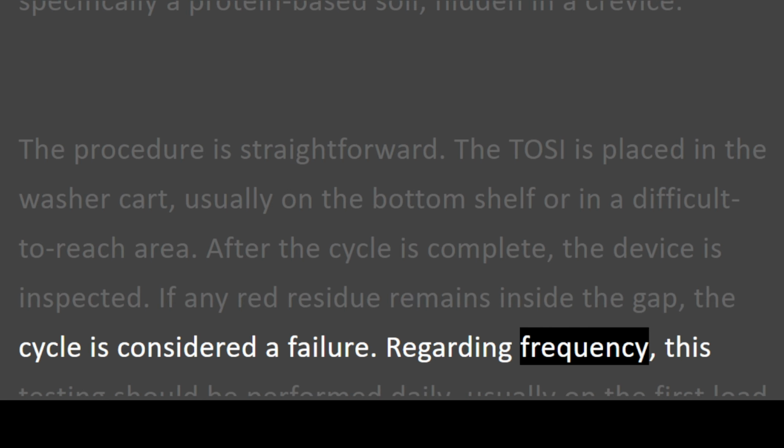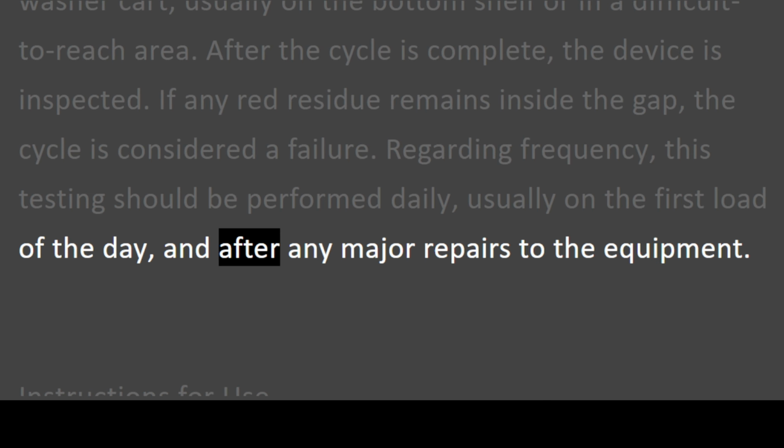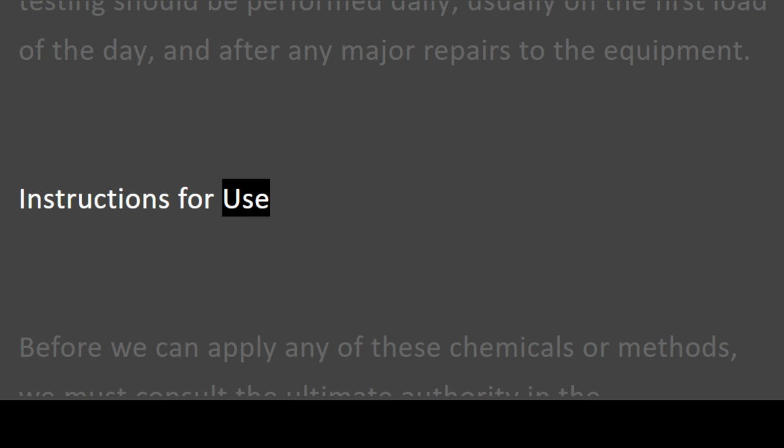Regarding frequency, this testing should be performed daily, usually on the first load of the day, and after any major repairs to the equipment.